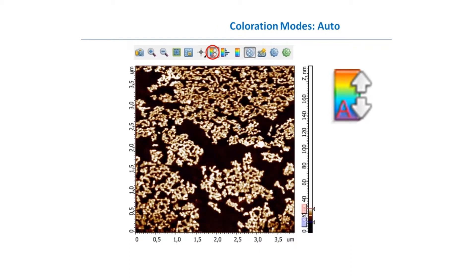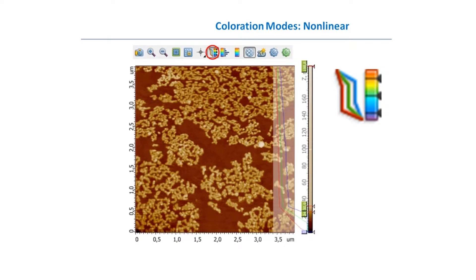Another way is to use the automatic button, which automatically cuts off a dedicated percentage from the histogram of the image, so pixels not in the main part of the histogram are not colorized. This percentage can be adjusted in settings.